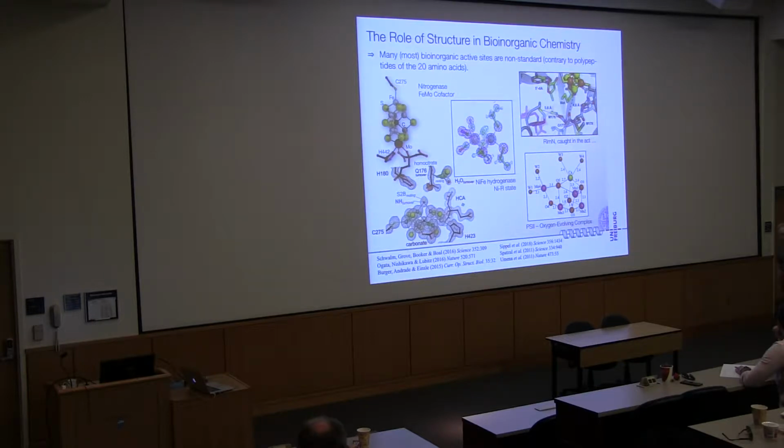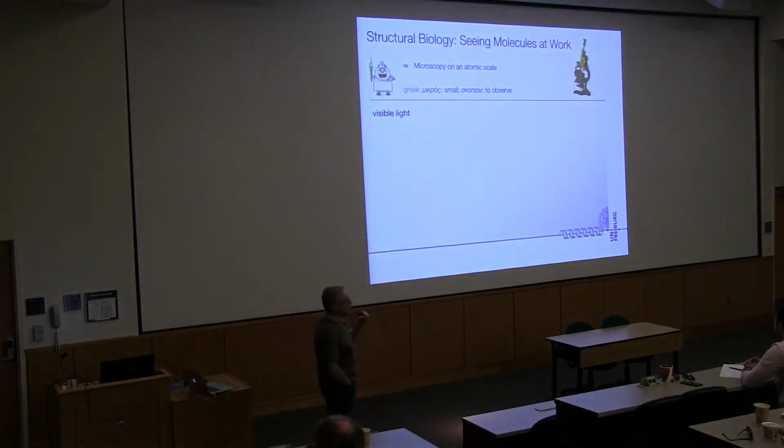Now, when I thought how to compress this whole thing in order to get all the information into these 45 minutes, let's see how far I get with that, I thought, I should be able to do that, but to make it a bit harder, why don't I include another topic that's a bit on every structural biologist's mind these days, and that is electron microscopy. Because what we really want to do, that's the basis of all this, is we just want to see something that's very small, right? That's microscopy.